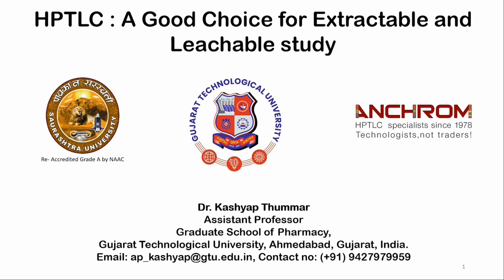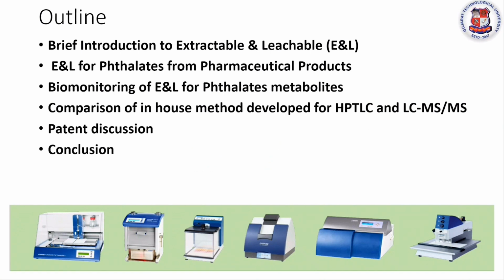Today I'm going to present my research on HPTLC, a good choice for extractable and leachable study. So let's see. This is the brief outline of my presentation. Basically, my presentation is divided into three parts. First part is extractable and leachable study for phthalates for pharmaceutical product.